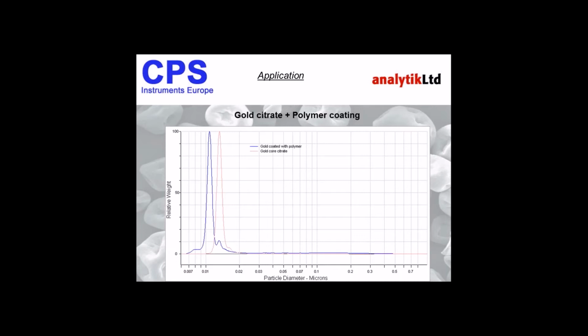It will be very challenging to be able to see both particles with most techniques. The reason why DCS works very nicely to discriminate these two material types is because we're working on density differences, not size difference. Because by coating the gold, we're drastically changing its net density. And so when we run a mixture of these two materials into our fluid gradient, we will find that the citrate core will sediment out first, and then the coated particles will sediment out later. So you get this separation. And we can see with the blue trace that we can still identify and quantify the amount of uncoated gold.